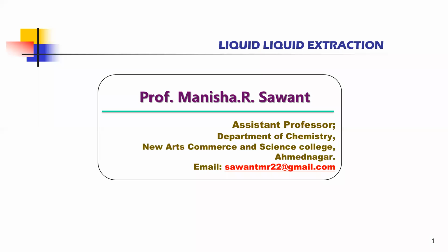Hello once again. Today we are going to discuss the syllabus from CHA 391, section 2, analytical extraction techniques. You have learned about pre and post extraction considerations in the first chapter, and in that we had discussed solid extraction sample strategies, solid, aqueous and air samples, how we can sample them, and chromatographic methods of analysis and sample concentration methods.